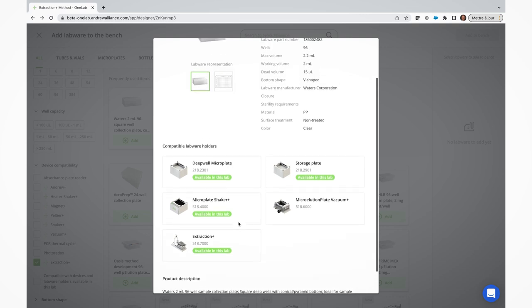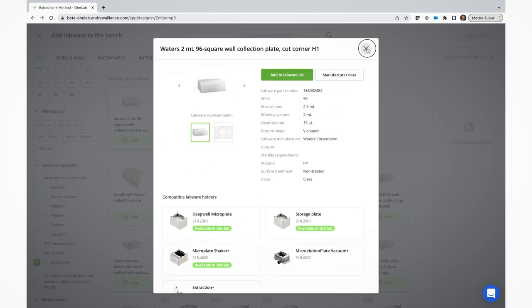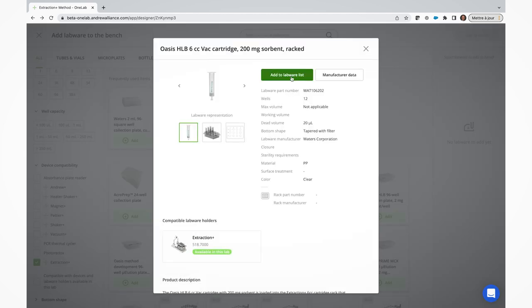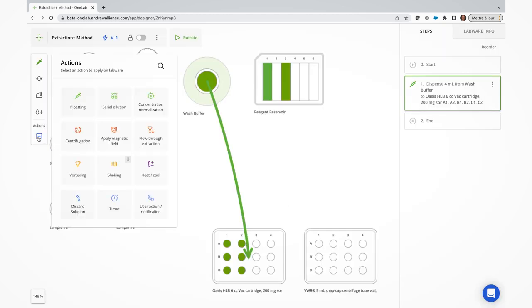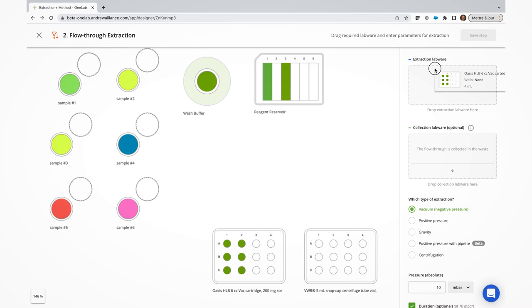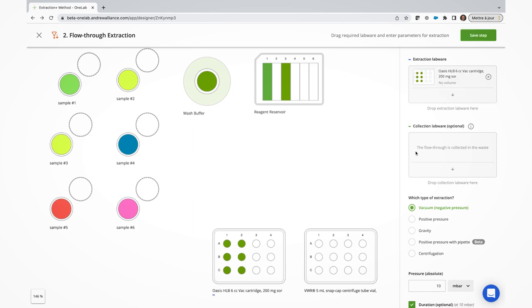Any consumable chosen from this filtered list will then automatically trigger the use of the device during the method execution phase. It's that simple. Next, click on the Actions button on the left panel. Select flow-through extraction from the list, drag and drop the consumable or consumables you want to apply the action to.